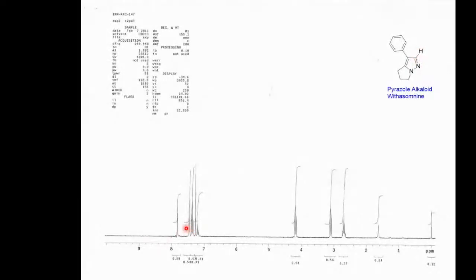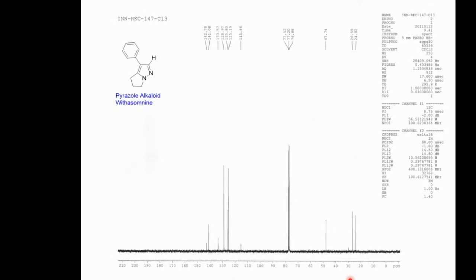And then you have the aromatic protons here. You have the para 1, then ortho 2, again meta 2. So all of them can be assigned. You also have the chloroform signal here. Similarly, the carbon-13 signal can also be assigned. You have 3 methylenes in the aliphatic region, and the most deshielded one is NCH2. The other two can be distinguished in principle, even though the chemical shift difference is only about 3 ppm. And I will assign tentatively the most shielded one could be this, and then the other one, the benzylic type. So all of them have been assigned.